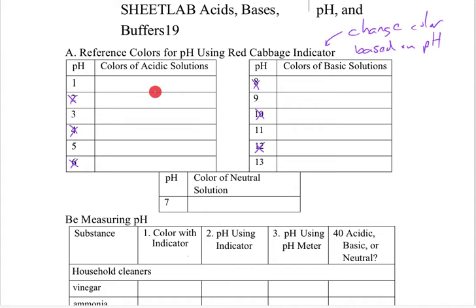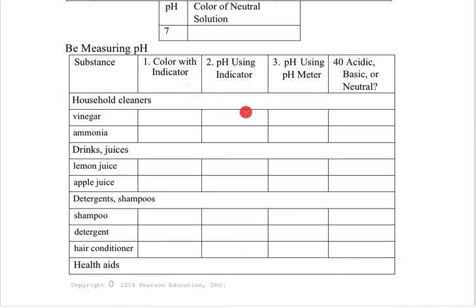Very simple reaction. I add a little buffer to a test tube, I add a little bit of the red cabbage juice to the test tube, and you see a color change. And what you'll want to do is write down the color that you see in these different boxes. The final image of all these different colors is going to be posted with this material on Moodle, because these colors are then going to be used in your other parts.